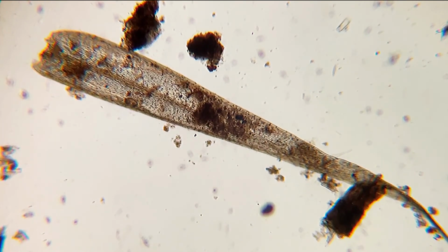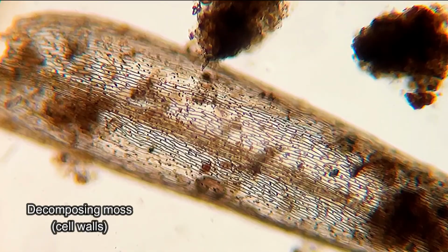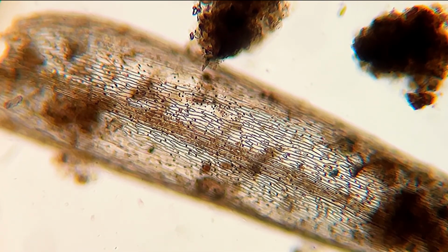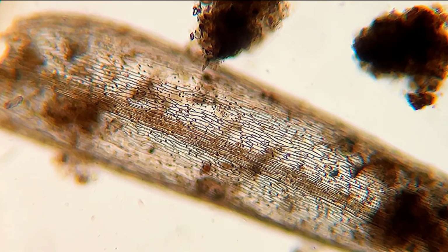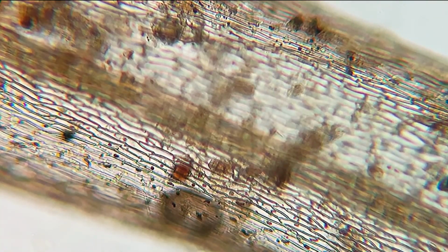This looks like a little piece of moss that is decomposing. If you pay attention, you can see microscopic creatures swimming by. But the thing that I find absolutely amazing is the beautiful pattern formed by the cell walls of the cells that make this little piece of moss. Let's look at this incredible structure at a higher magnification.